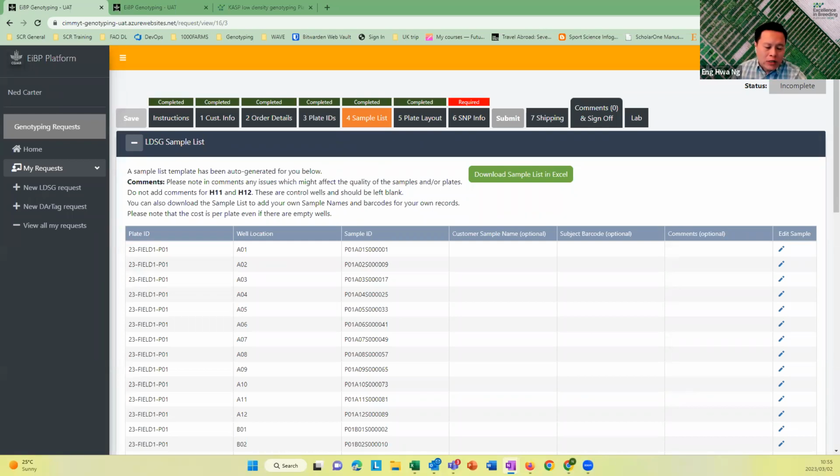So we're trying to avoid that as a trade-off in the first minimum viable implementation. But as we become better structured, we certainly want to make sure that people already in some kind of breeding database will have the ability to port over the IDs without having to do the double work. That's something we will be talking to the various breeding databases about, to see how we can make those connecting pieces.